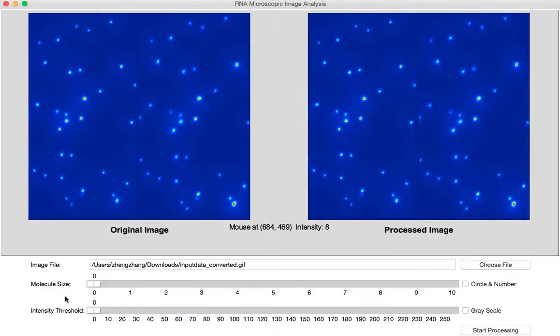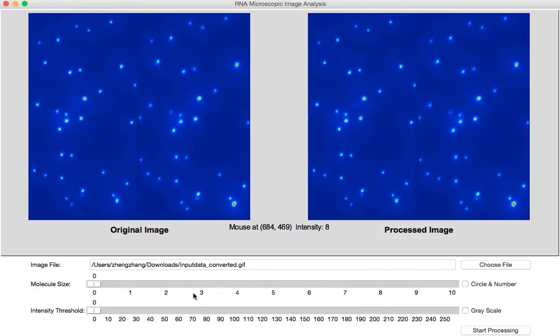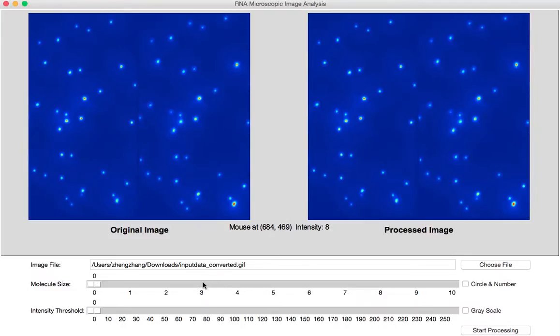We can see a scale of molecule size from 0 to 10. For instance, 3 means there are 3 by 3 which is 9 pixels connected together to qualify for a single molecule. We have a size range of 1 pixel to accommodate any uncertainty errors. Thus size 3 means that the spots on the image with 8 to 10 pixels qualify for a single molecule.